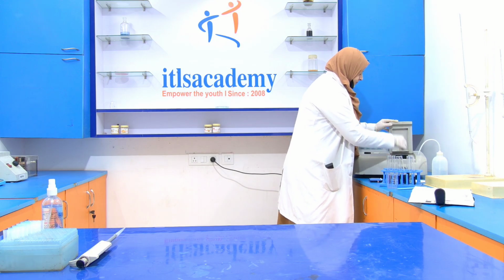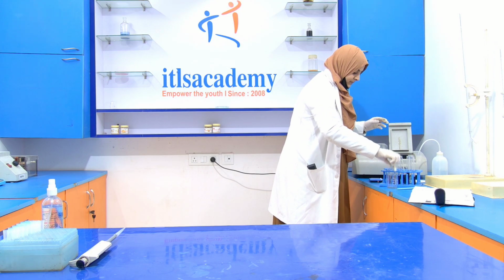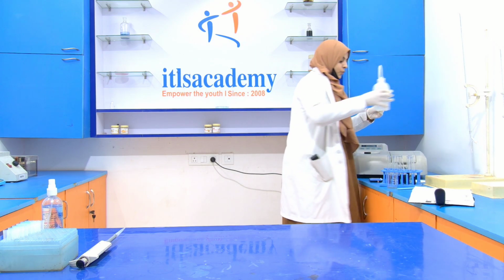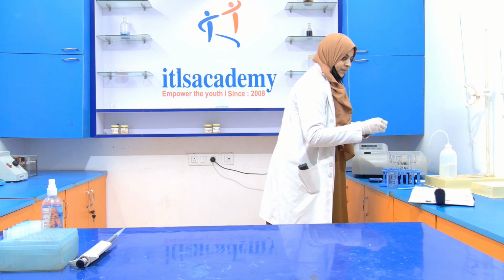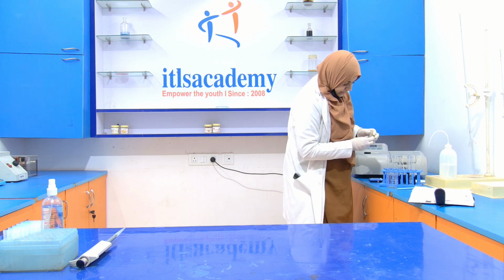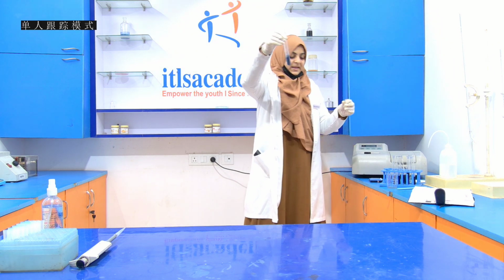Now take this out, discard this, then wash with distilled water so that the residue of the blank will not be there. Then take the 0.2 ml of the BSA.